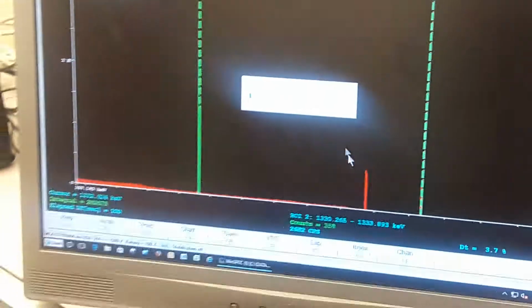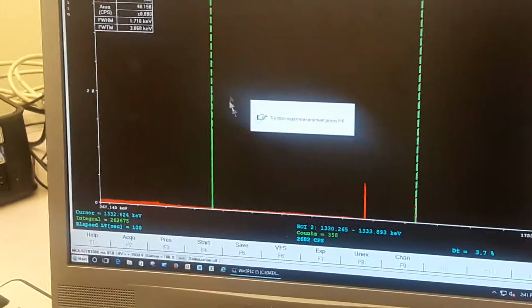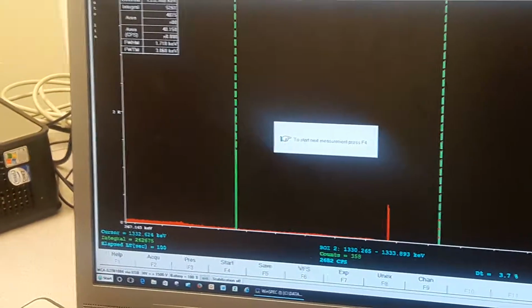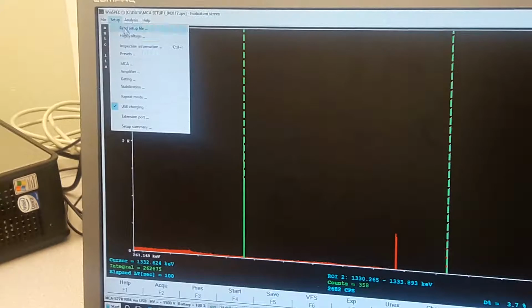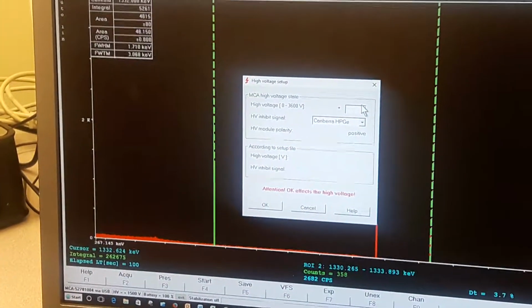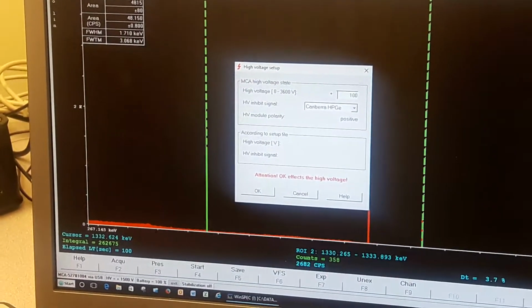because of the analysis work that I'm interested in, I'm going to do the analysis work through another video. So in order to do the analysis work from another video, what I'm going to do right now is go ahead to my setup, go to my high voltage, and turn my high voltage off because I will install spectral line on the other side.